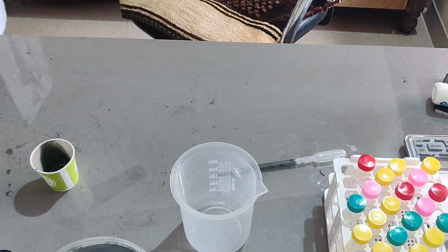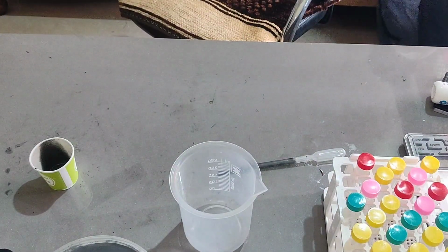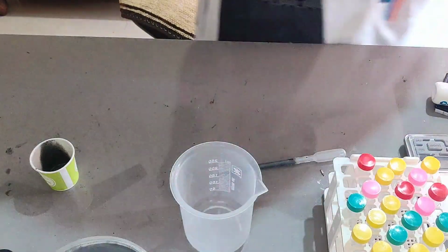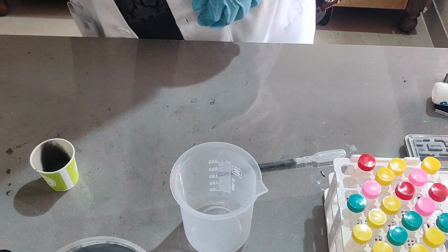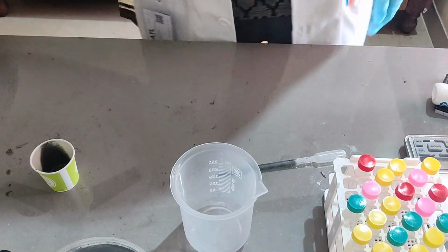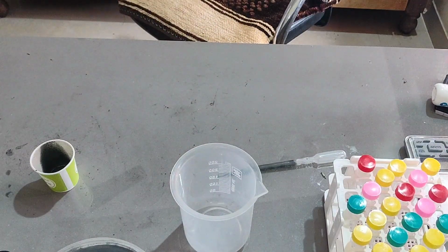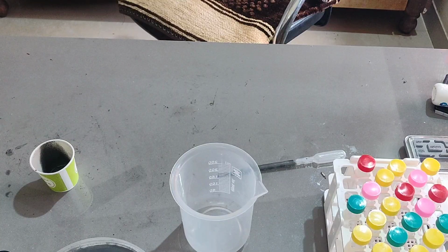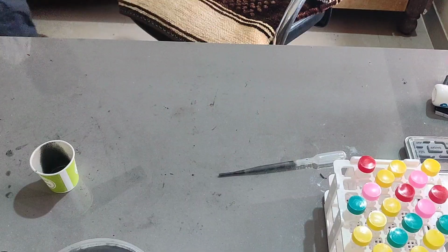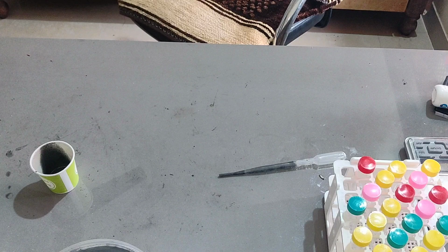The beakers have been cleaned. I cleaned them yesterday, right after we finished the experiment, so that they don't get too stained. And all of the glassware is clean, to be honest. The stir rod, the dropper, the beakers, all of them were cleaned thoroughly yesterday. Okay, I have got a mask here. I can just use the same mask from yesterday as well. There's no need to change masks or anything, because you're not working with something that dangerous. I just go get the water in this plastic beaker.